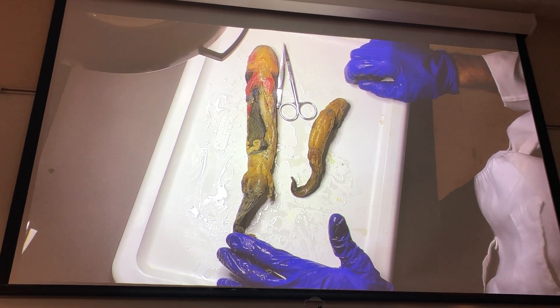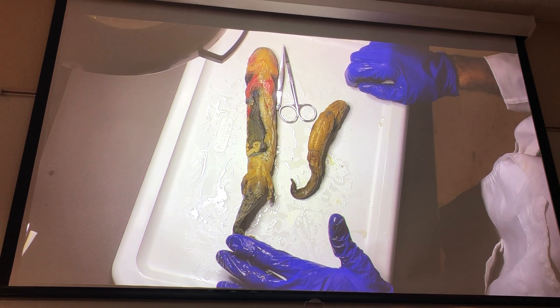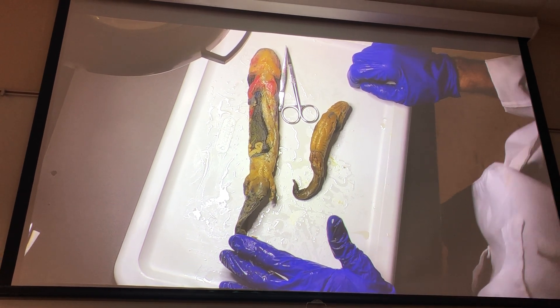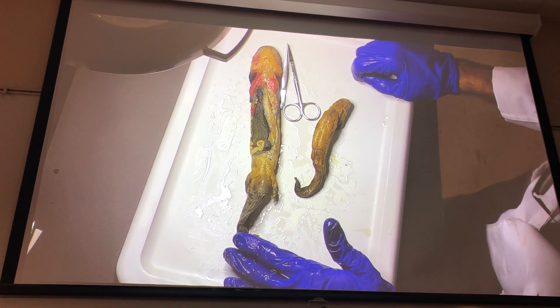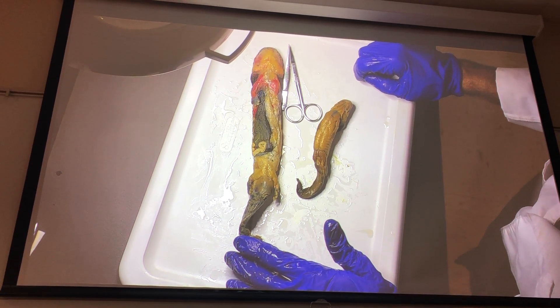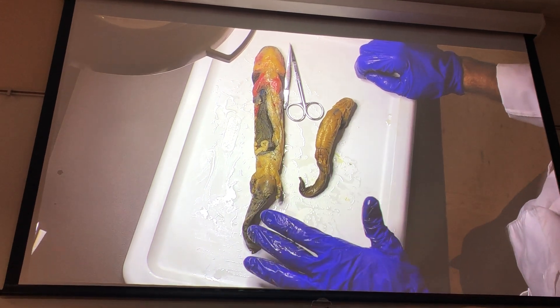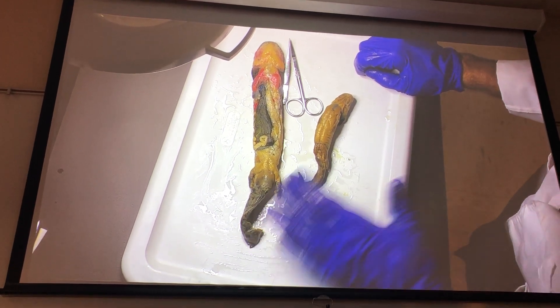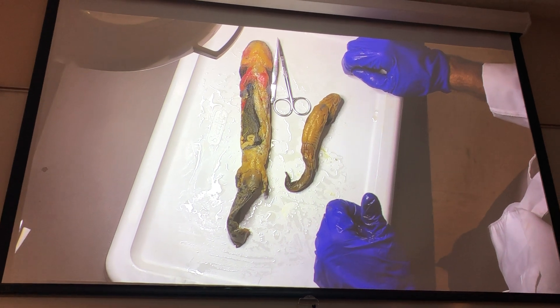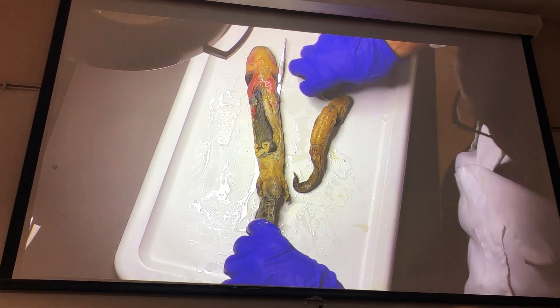A little extra pressure — you're going to have to take very good care of your mud puppies, because we just found out that there are no mud puppies available for next semester. So we're going to use your animals to demonstrate next semester. Some of you will still be here, but we'll be using those mud puppies to demonstrate. So your dissection is going to be pretty important, which is why I'm doing this one for Joshua.